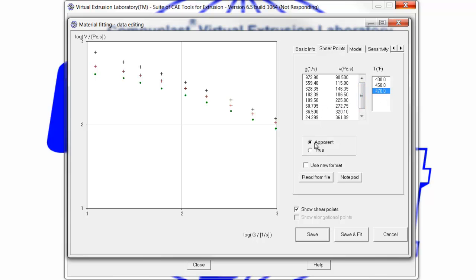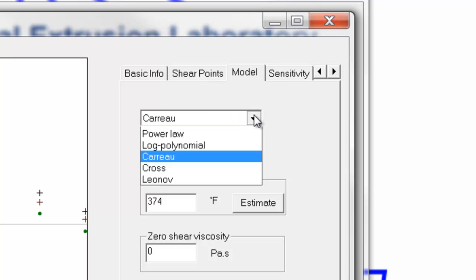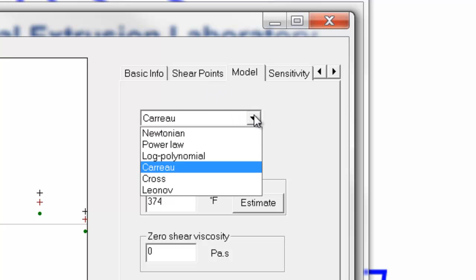This data was apparent viscosity data, so it needs to be corrected for the Rabinowitz correction. If it was corrected data, we would simply click true, but since it was apparent data, we click on apparent, and we move on to the model tab.